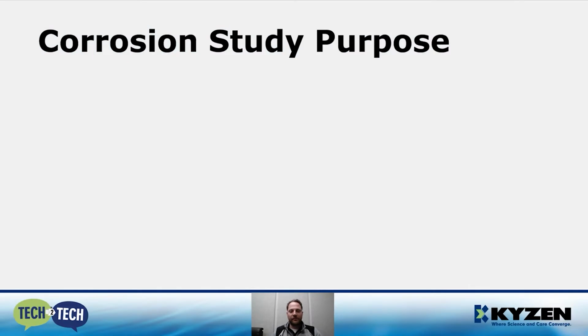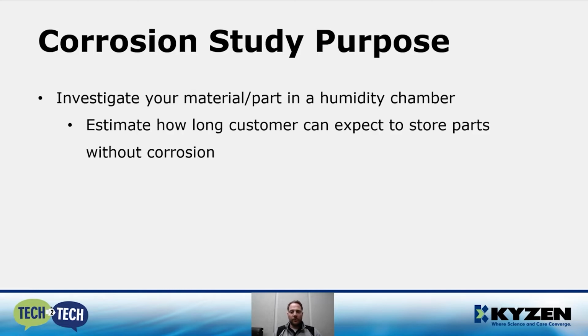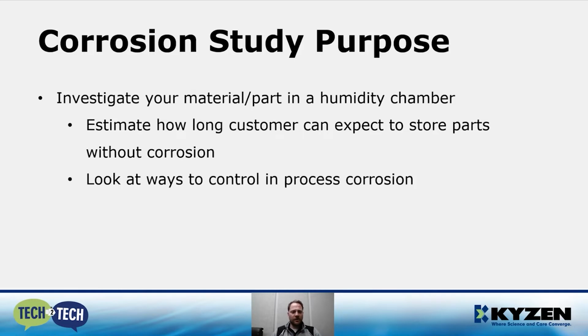So a corrosion study, what is the purpose of a corrosion study? Really, the purpose is to investigate your part, or whatever material your part is made of, and how long it takes for that material to experience corrosion. Essentially, we're trying to give a customer a sped up view of how long they can expect to store their parts without those parts experiencing any corrosion. It also gives us some ways to control our in-process corrosion.